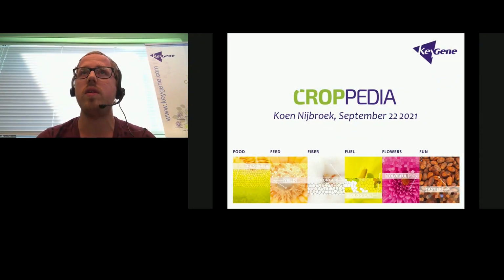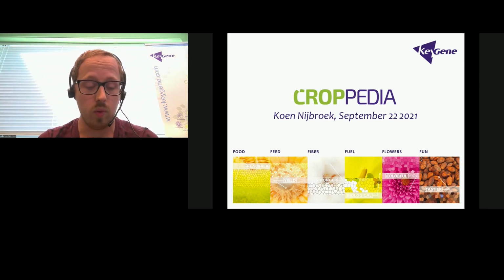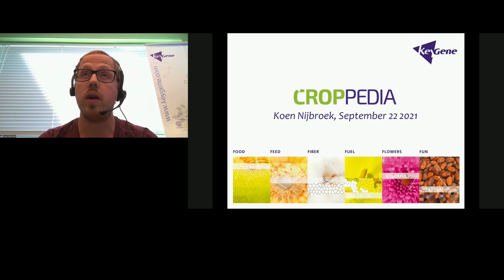So the way that this morning will look like is I will start with giving a general introduction about the core functionalities of CropPedia, then switch over to the pedia that you are probably most interested in, the WeedPedia. And since the WeedPedia is fairly new and still fairly empty with data, we will give a live demonstration by a rice use case. And then later on, I will also in detail explain about all the different types of data that you can put into CropPedia and how you can visualize that. So there will be breaks and Q&As in between, so don't hesitate to ask any questions.